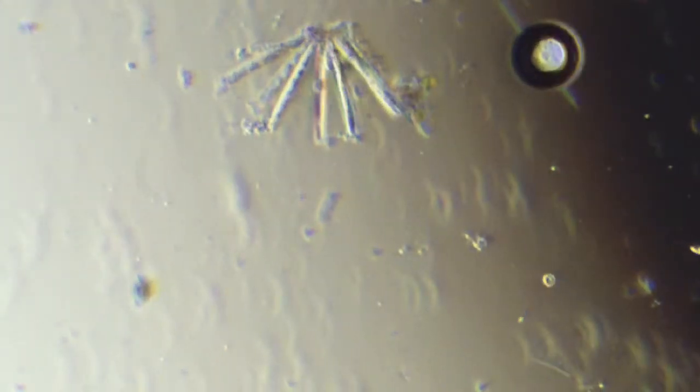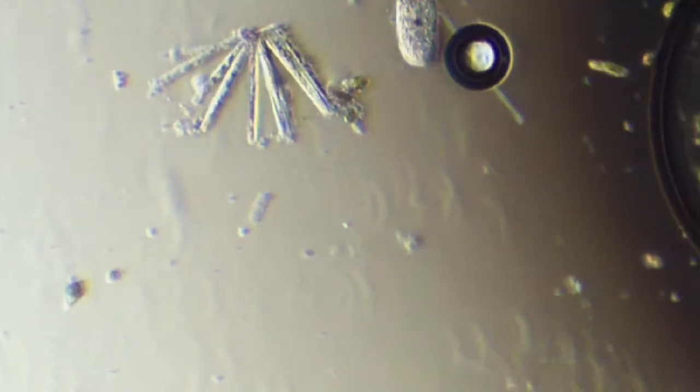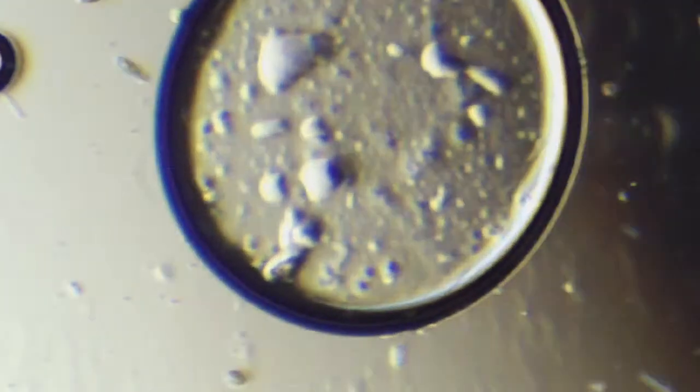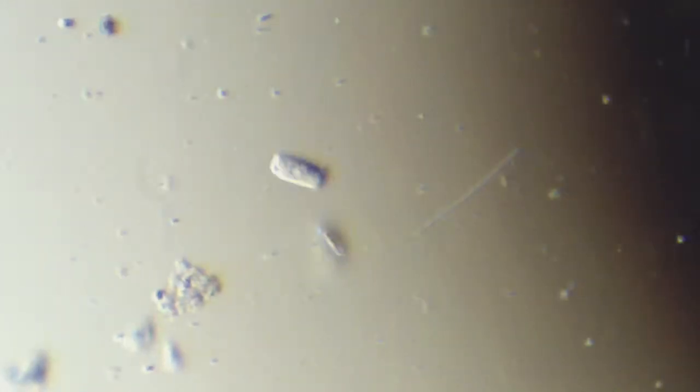There's some more diatoms in an arrangement next to that big guy. Oh, there's another cool kind of boxy ciliate. Very fast. Where are you going? He's in a hurry to get somewhere. Come on. Oh, and joined by another one. Yay. That one's got some cool contents, and if it would slow down, you'd really see it.